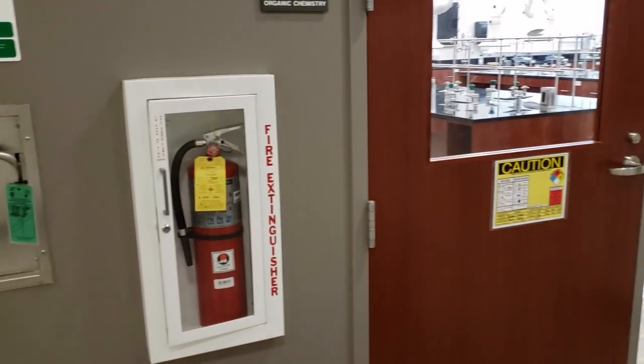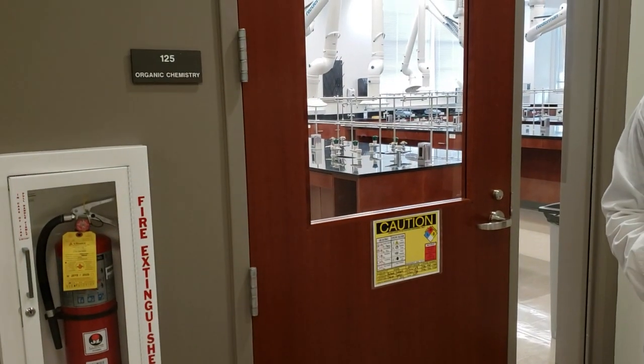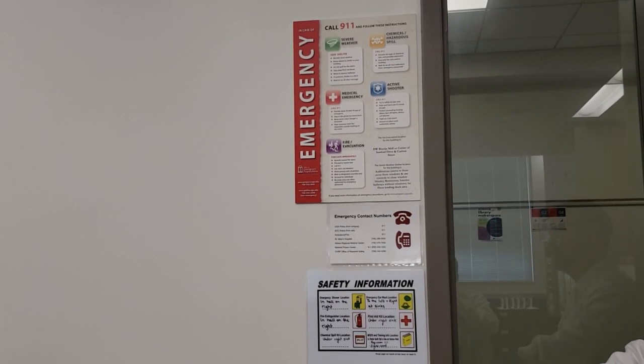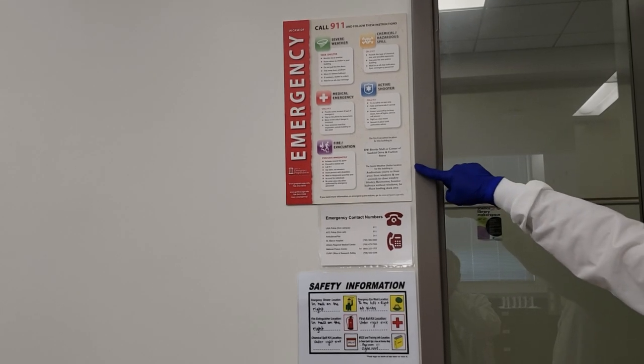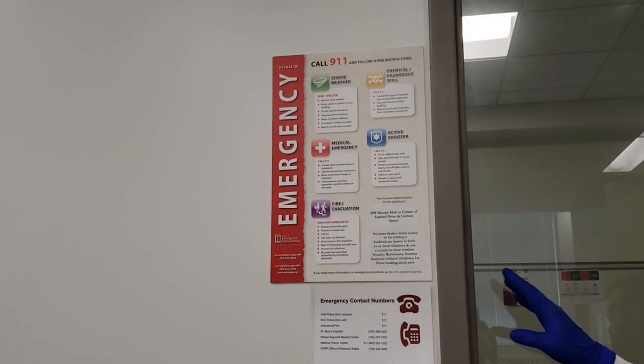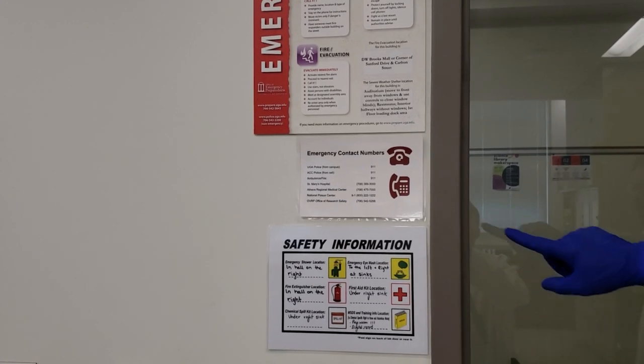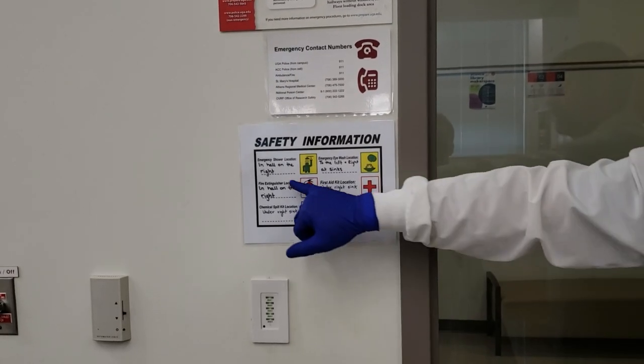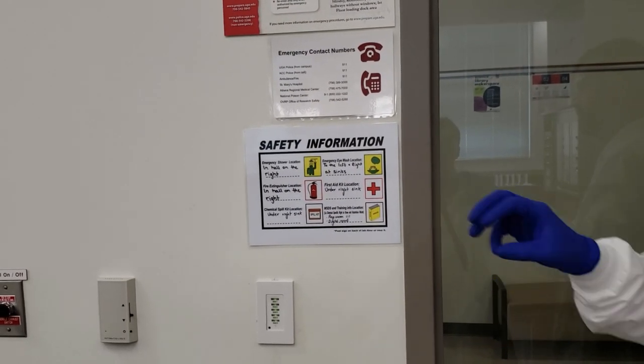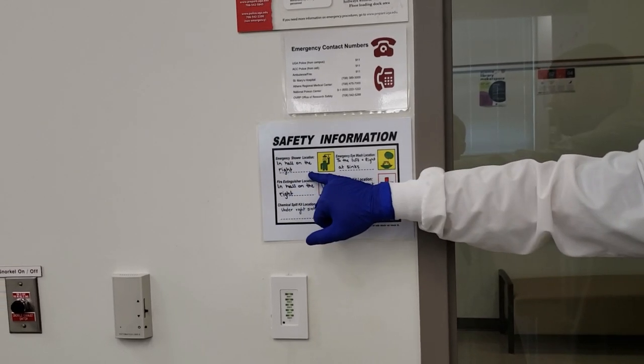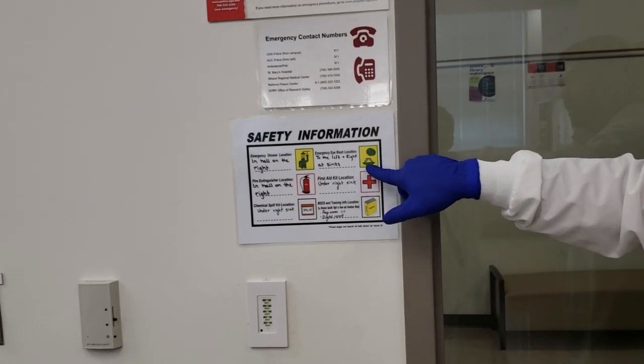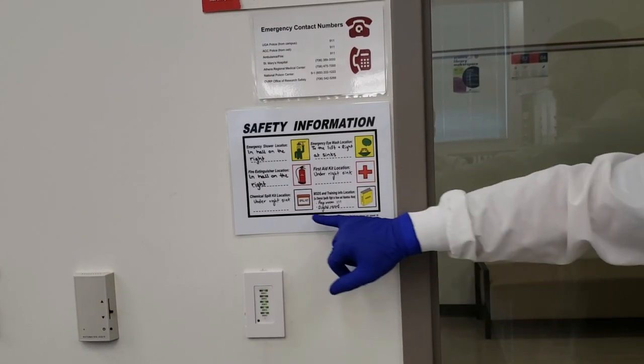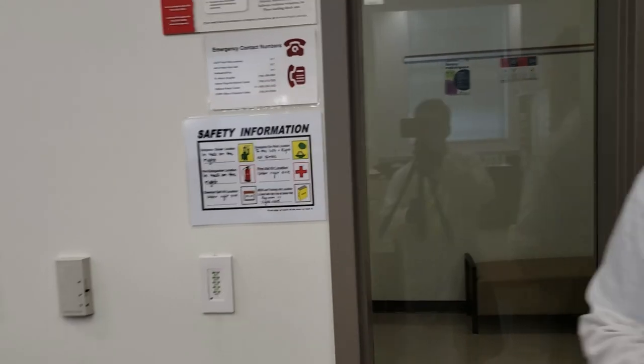Once inside the lab, we have emergency and safety signs with useful information. We have emergency condition signs available throughout the SLC, emergency contact numbers, and safety information showing relative locations of all safety equipment: shower location, eyewash stations, fire extinguisher, first aid kit, spill kit, and MSDS sheets. Let's take a look at some of these items.